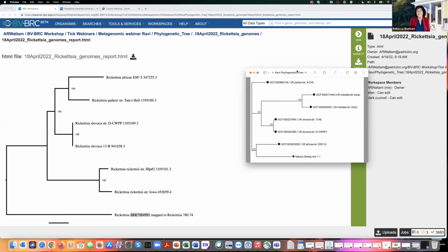I build tons of trees, and I go in and I do my own pruning as well, because when I'm going to publish, I want it to be the best tree possible, and I want to have the best representatives. So I am very careful on what I include. And I know it doesn't sound vain, but I also limit how many genomes I will include, because I want it to look good in a publication. So at first I'll run everything, and then I'll start pruning down. But also this report, and I'll show you, will give you some hints about what to include.